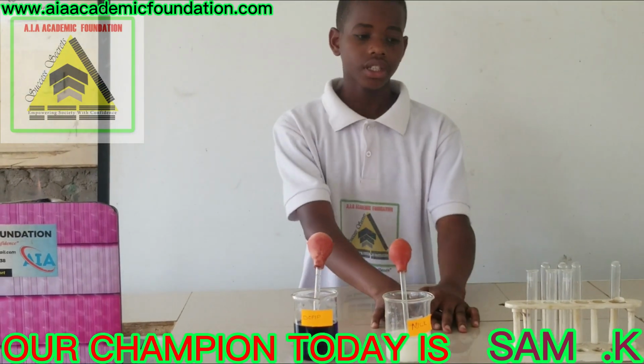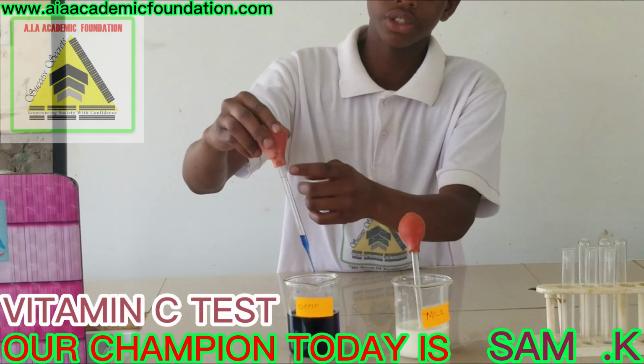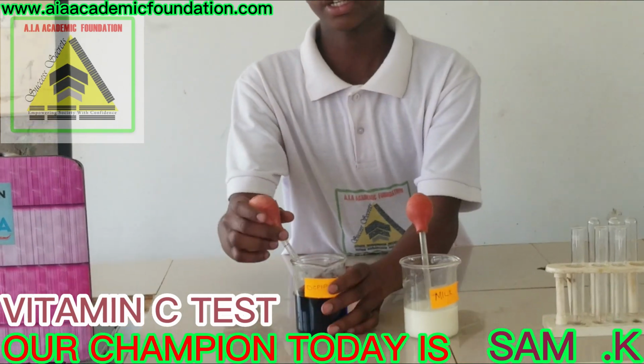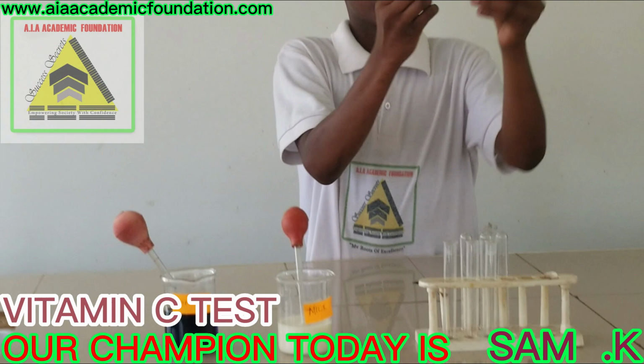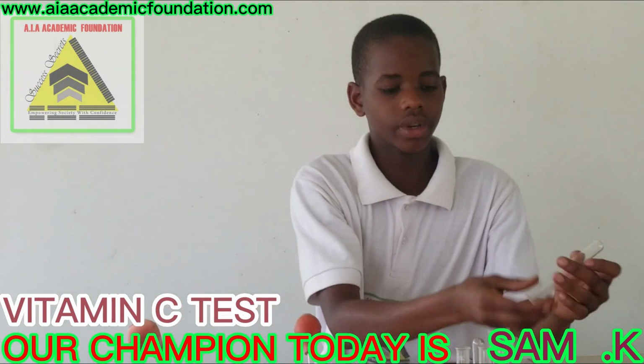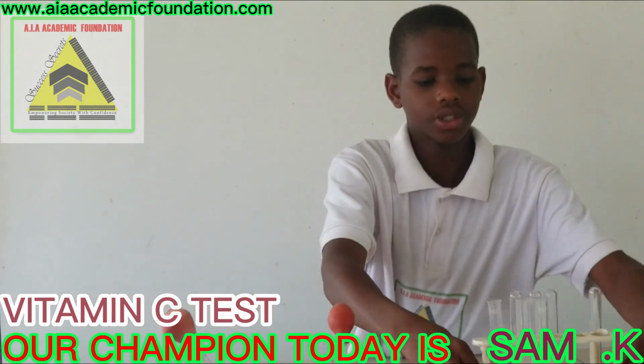For vitamin C, the apparatus that you see here, we shall need the dropper. This one you see. Then this is a glass beaker. Then we have a test tube here, which you see here. Then we have a test tube rack, which is used to hold the test tubes.